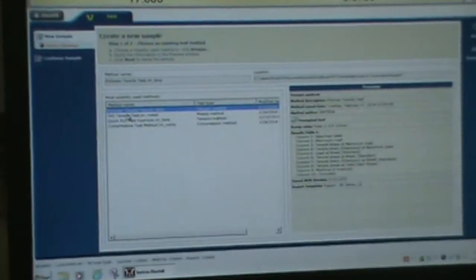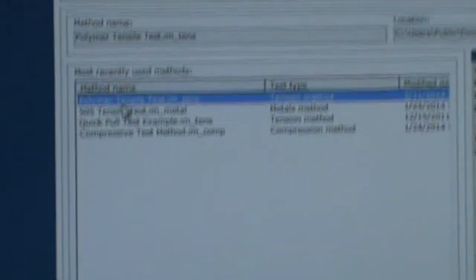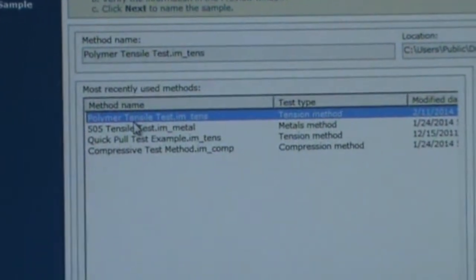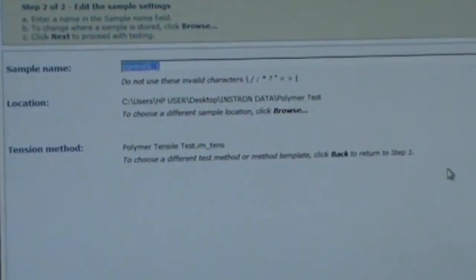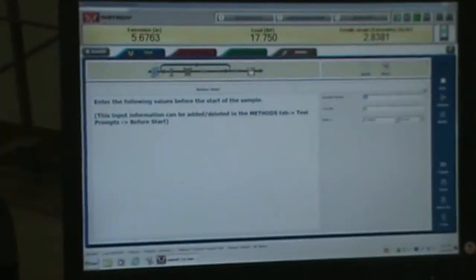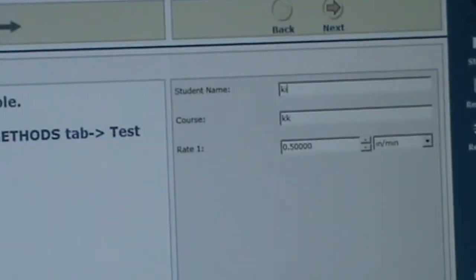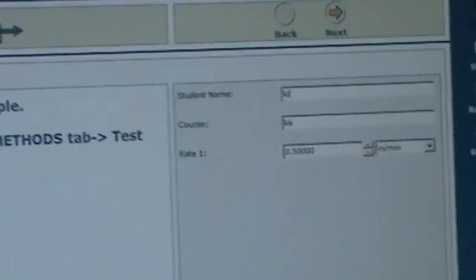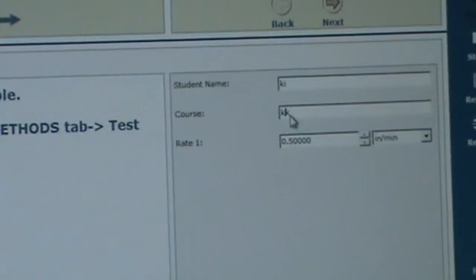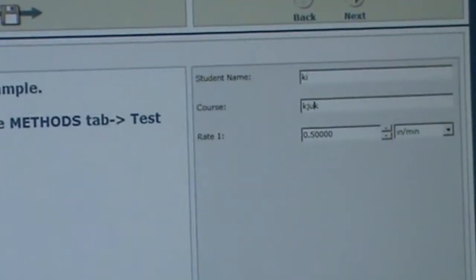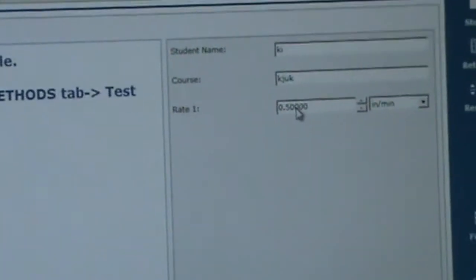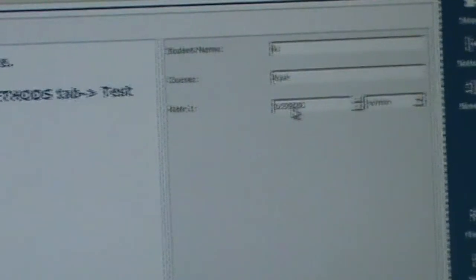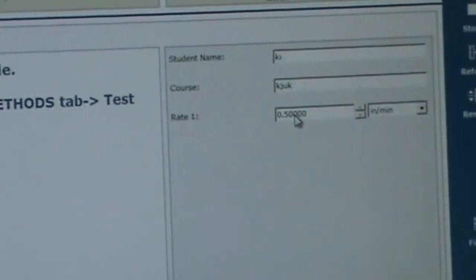Now here are the tests that are programmed on this machine. We're going to use the polymer tensile test. So we're going to double click on that. Now here, it's best if you come over here and put it next. This is where you want to put your name. I'm just going to put something in there. The course, whatever you want to put in there. Now, this is the rate that the crosshead is going to go. How fast the head moves up and down.